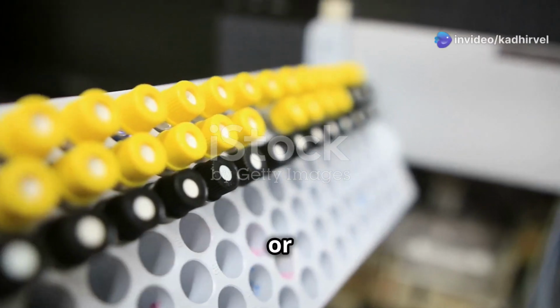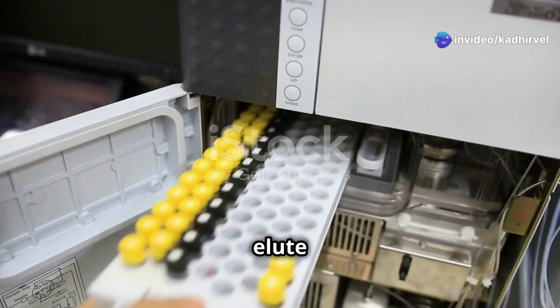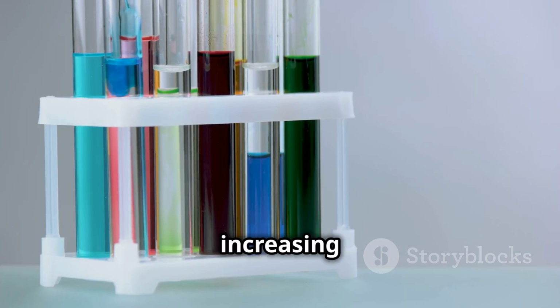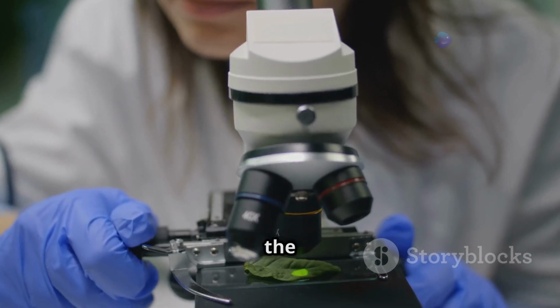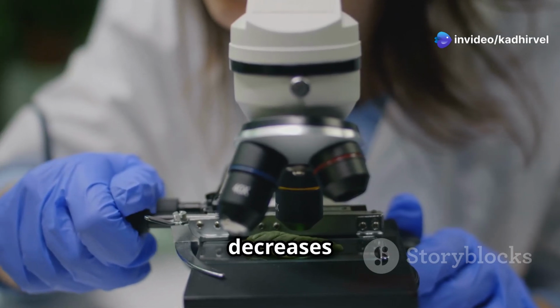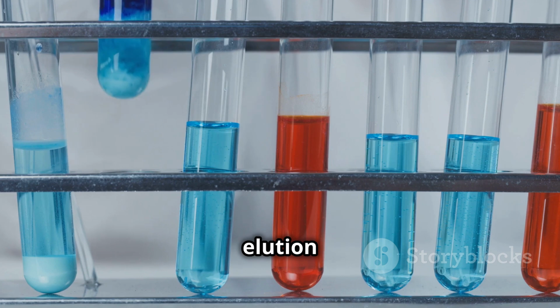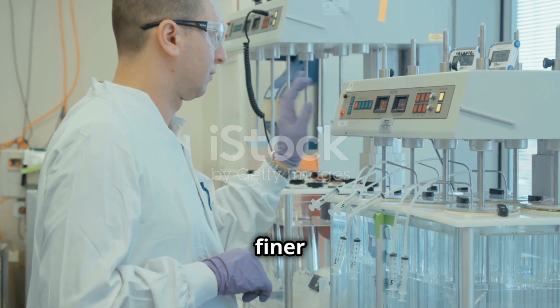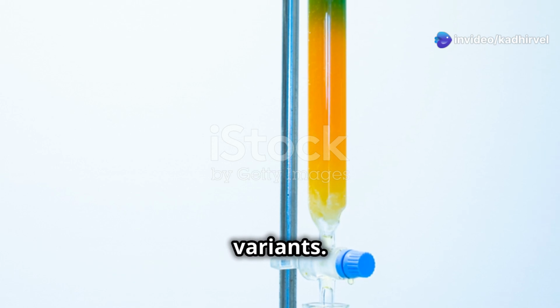During the salt gradient or pH adjustment, acidic variants with lower net positive charges elute earlier than the main mAb form because they are more readily displaced by the increasing ionic strength in the mobile phase. The strength of the interactions between the resin and the mAb, or its variants, decreases as salt concentration increases, leading to a sequential elution based on charge differences. A shallow salt gradient provides finer control, allowing better separation between closely related charge variants.